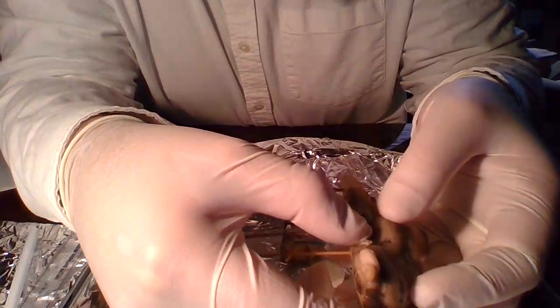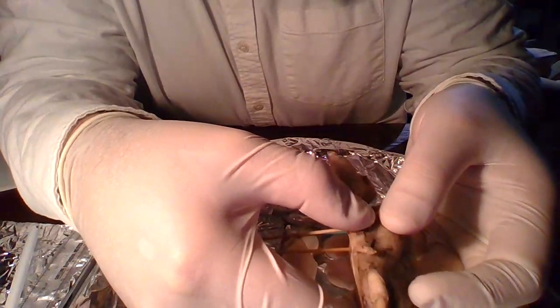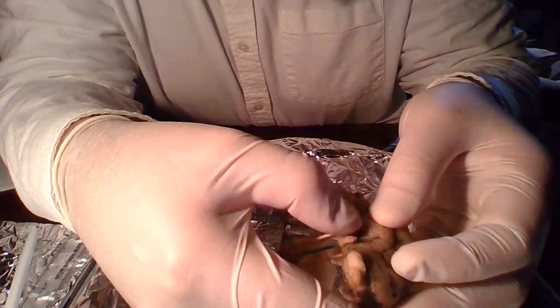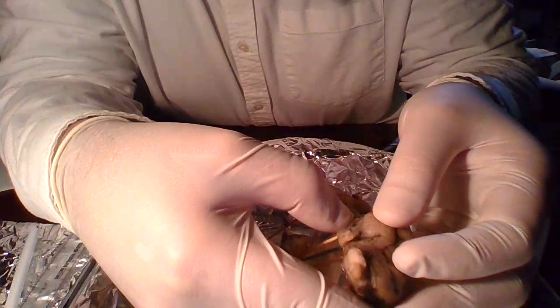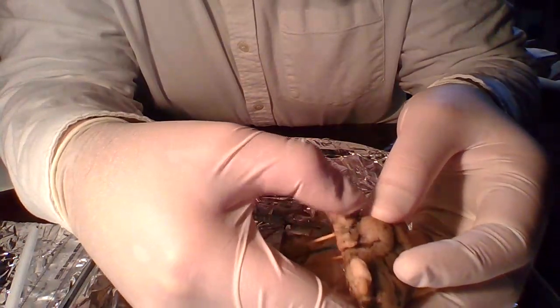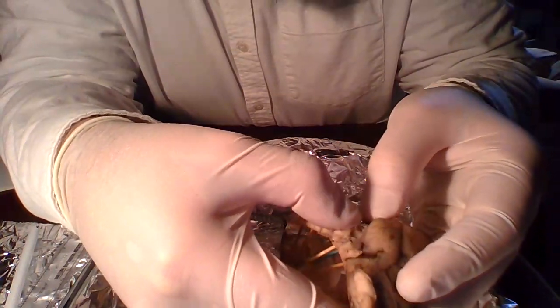Now there is something about the temporal lobe here. It's connected right down there a little bit at these two ends. I just pulled apart the pia mater. Let's see if there's anything more I can pull apart. Gently. Oh yeah. There you go.